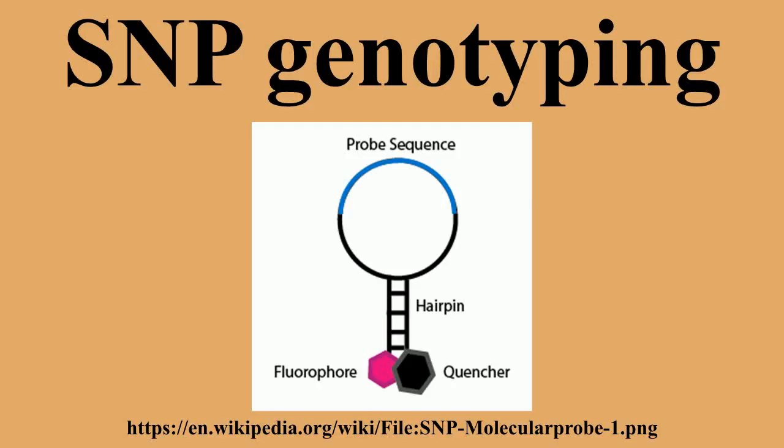High-throughput sequence data can be generated from the ligated products and genotypes determined. The use of large numbers of sample indexes allows high-throughput sequence data on hundreds of SNPs in thousands of samples to be generated in a small portion of the high-throughput sequencing run. This is a massive genotyping by sequencing technology.